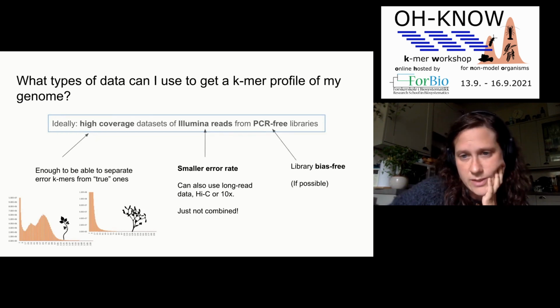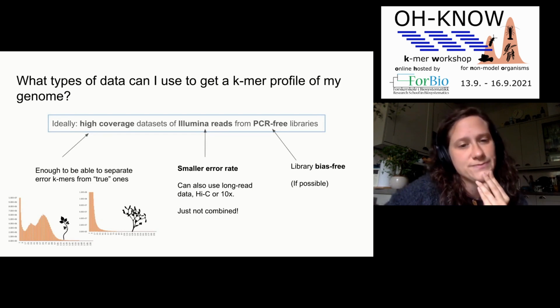And yeah, we just want to mention that PCR-free is ideal, because it's more bias-free. But we all work with non-model organisms, and we know sometimes it's just not possible to get PCR-free libraries.